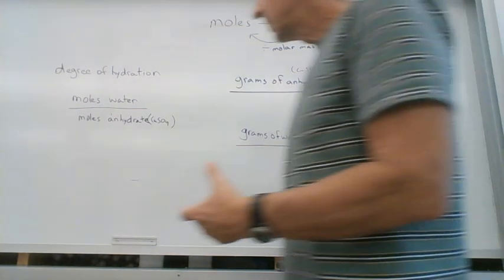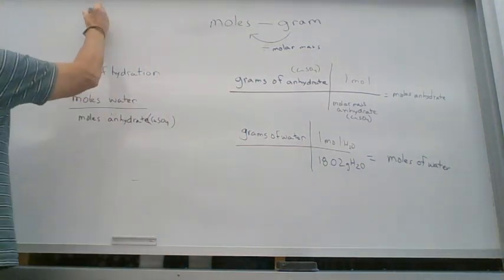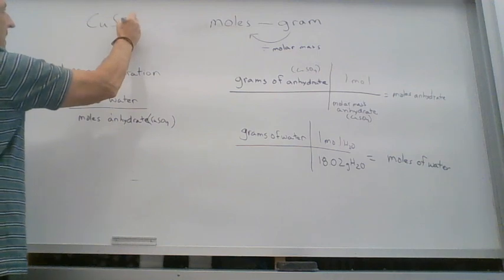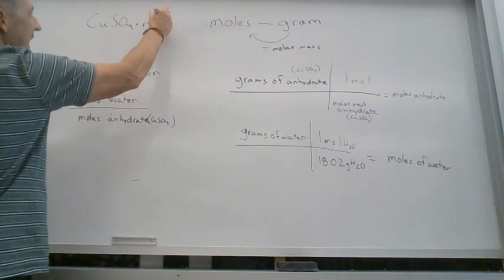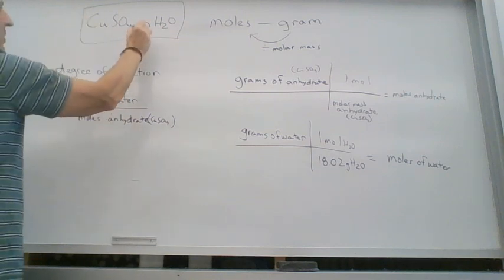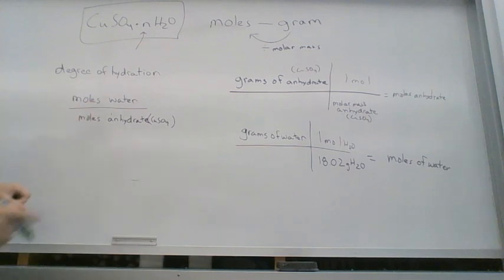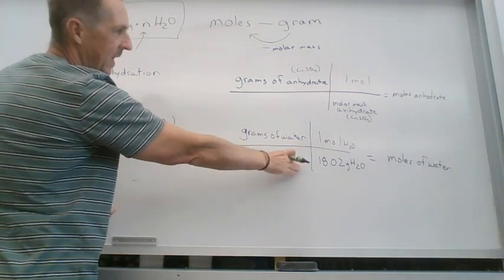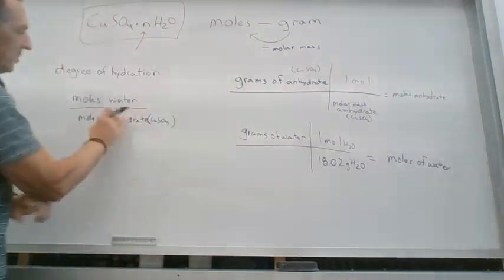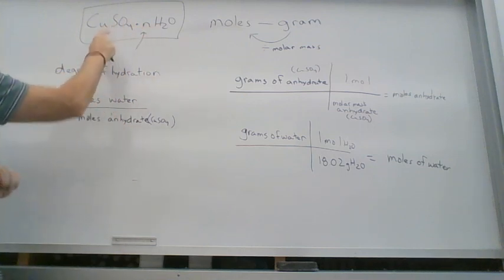So the next thing you have to do is figure out the degree of hydration, which is that N that we started with. So what we're trying to do is determine what this N is, which is the degree of hydration. So if we take the moles of water that we calculated here and divide it by the moles of anhydrate, that gives us the ratio of water to copper sulfate.